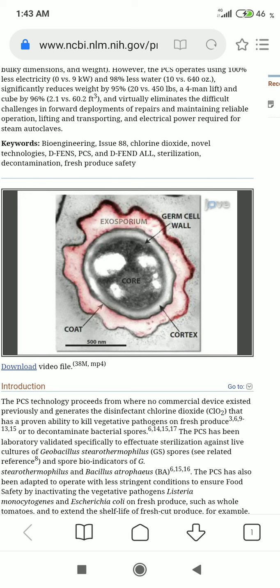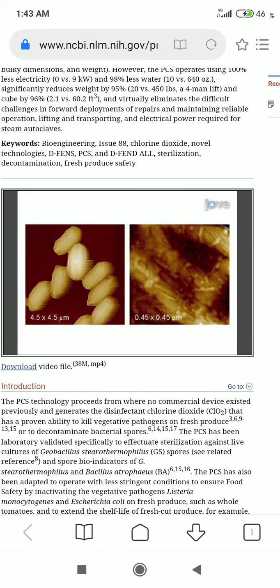The exosporium is readily seen for B. cereus, although not all spore species have this layer. High-resolution atomic force microscopy images show chlorine dioxide-treated Bacillus subtilis spores remain intact without collapsing during air drying, and that the spore coat architecture and topology are unaltered by chlorine dioxide treatment.